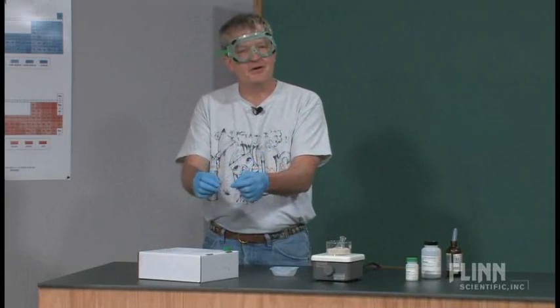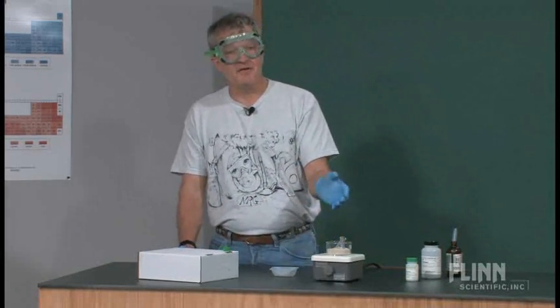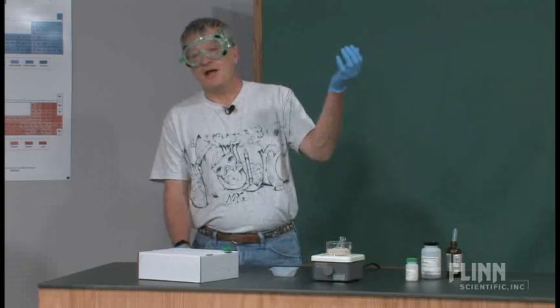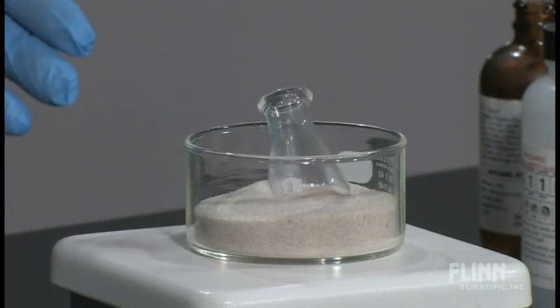Remember how much I put in here was only 10 or 15 drops at the most. It's not going to take very long for that liquid to be driven off. Again, this should be done in a well-ventilated area.